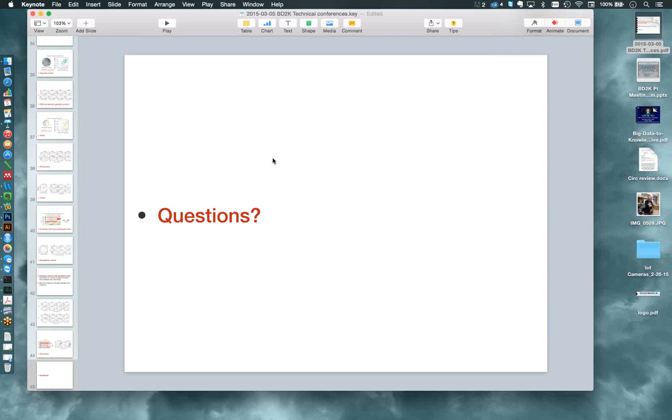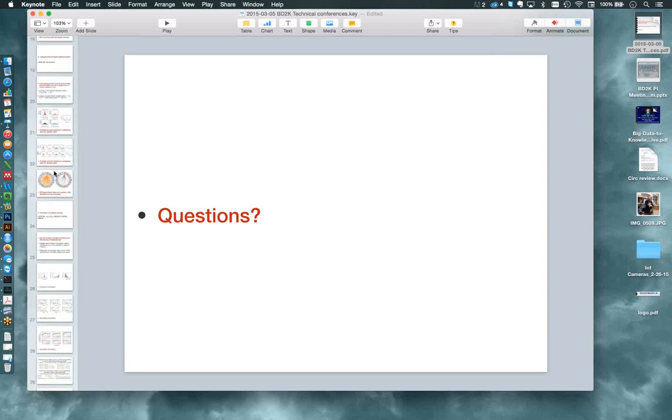I think in terms of graphics, I tended to do the post analysis in R simply because of the graphical capacity. It just gives nicer looking graphics than what we had in Java.